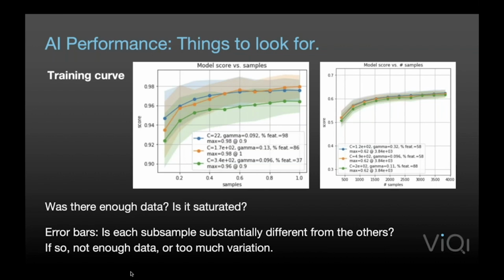And on the bottom, we're looking at the fraction of the samples that we used to get that level of performance. And so you can see as you increase the samples, you get better performance. And then you have kind of a plateau, or at least you have a region of seriously diminishing returns, and it plateaus out at a fairly high level. So we get, with 60 or so % of the samples, we are essentially topped out at just short of 98% accuracy. So that's really good.